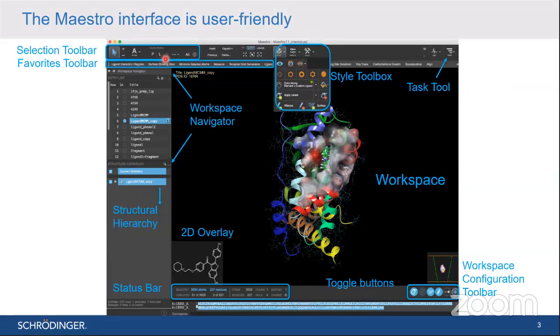If you are not happy with this automatic selection mode, you can also customize your selection. For example, if I want to select residue number 2, 3, and 4, I can use this customized selection button here. Then you have various center-to-workspace buttons, meaning fit to workspace. These options are present straight in front of you in the top middle. It says fit everything to the workspace, fit selection to the workspace, fit ligand to the workspace. These are the fitting buttons. Whenever you feel like something is missing and you are not able to see the molecule on your visualizer, give a try to fit all those things to the workspace. It will show you everything which is present on the workspace.